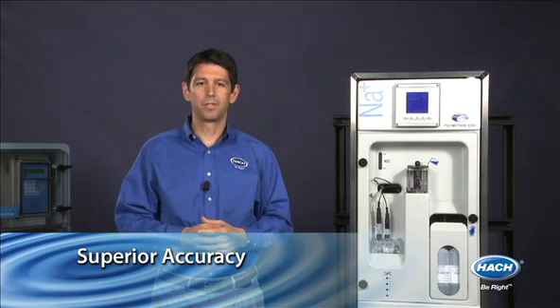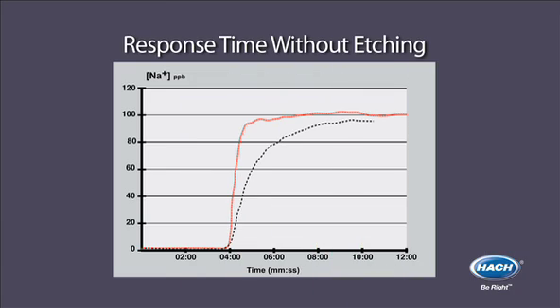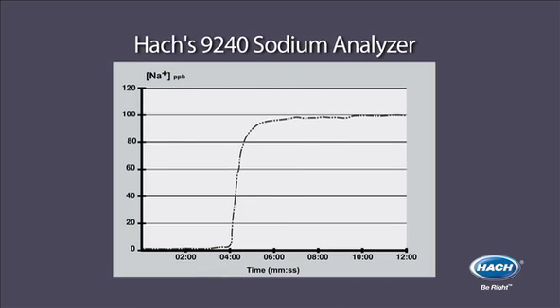If you currently use a competitor's sodium analyzer, you probably etch your sodium electrode every week to wake it up as the response time slows down. Without any acid etching, the response time doubles after only three days and doubles again after five days. With automatic reactivation, only available in Hach's 9240 sodium analyzer, you can ensure a rapid response without ever having to use hazardous hydrofluoric acid etching solution.